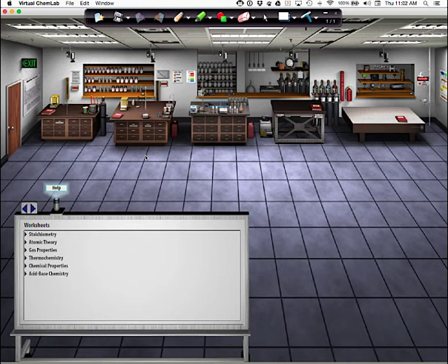Guys, there are actually 5 lab benches in this software, and let me tell you about them. The reason I'm telling you about these is because when you're done with the lab, which will take you about half an hour on Monday, you'll have about 40 minutes left. Guys, if you want to fiddle around with any of these other lab benches, feel free. It's actually pretty cool. So let me introduce you to them.